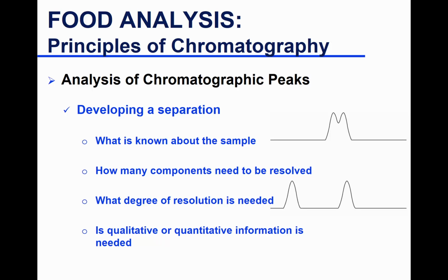So sometimes you go for speed. For speed, you would say, okay, I'm just going to have a quick flow rate. I don't care for them to be separated really well. And sometimes, no, I need to slow down. I need to have good separation, even if that means longer analytical time. And then that answers this: is it qualitative or quantitative? Am I after identification or quantifying compounds?